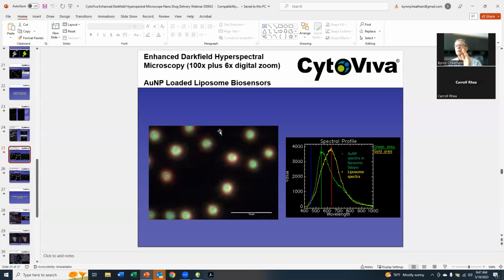And then that may be hundreds of pixels of this sample, and I can filter that against every pixel in the negative control. That output will be a spectral library of individual pixel spectrum that we can then use to do the spectral mapping. And we can do that with a high degree of confidence. That's something we can get into if we're working more one-on-one with someone, either on site or with your samples.